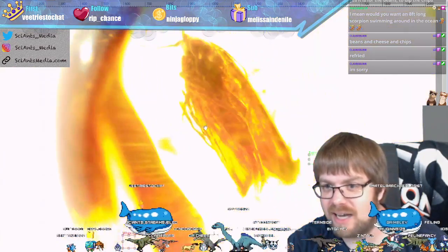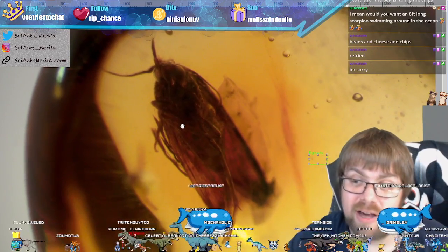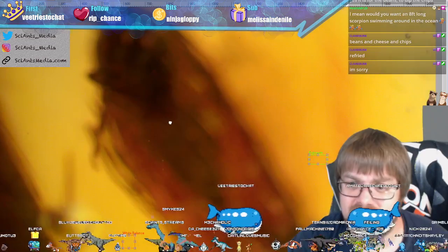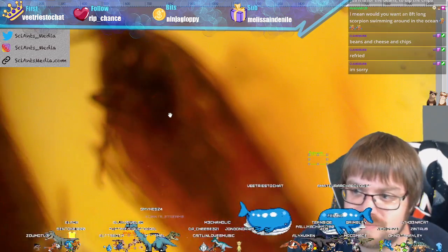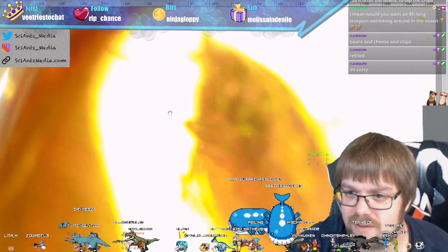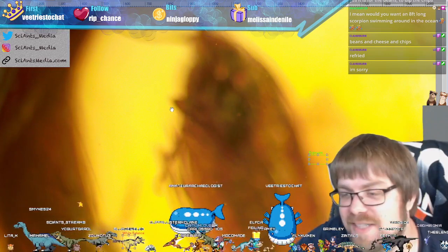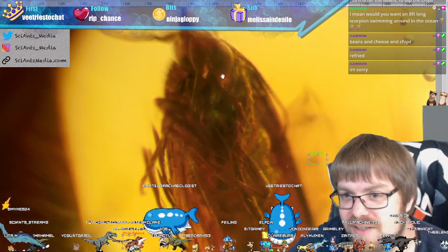Here is the underside of our little moth. I don't think Theo has seen this one, Claire. Of course, it's on a curved side of the sample, so I have to be ever so gentle. There it is.